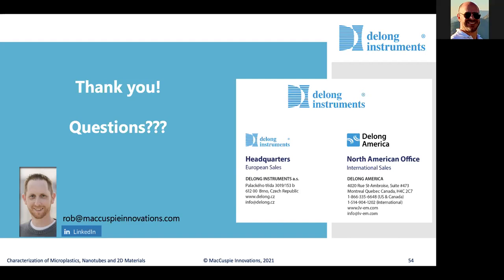We have two more questions, Rob. Both are specifically related to LVEM, so I think I'll address them directly. One question is about the type of grids to use with LVEM, which is somewhat dependent on the specific application. For the nanoparticulate materials we were talking about during the presentation, we typically recommend ultrathin carbon film grids. These would be metal grids, and it doesn't specifically matter if it's copper or nickel, for example, with a thin film of carbon, typically in the range of 3 to 15 nanometers in size.